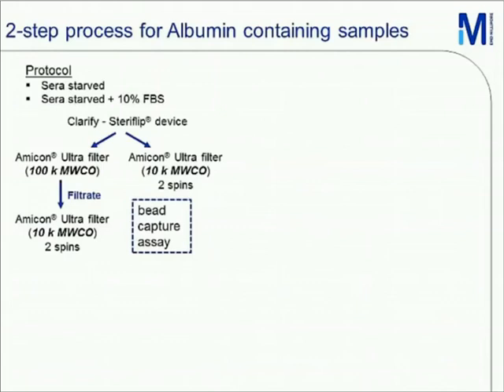To look at this, we took media from serum-starved MDA and added FBS to it just prior to processing. Samples are processed according to the standard 10K method and the new two-step 100K, then 10K format. Resulting samples were assayed by bead capture.